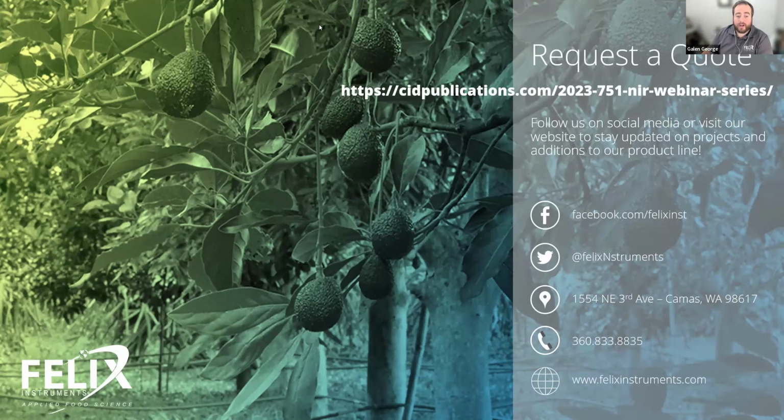So the next question, I guess it's actually a good question that I did not address. But this question is, how are models transferred from one equipment to another? Are they transferred as a file that you transfer by email? Can you transfer all the spectra collection and analytical testing? So this is a great question, and I did not address this, but with our instruments specifically, and it's going to vary based on the kind of instrument you're using, but I will speak about the F750 and the F751.